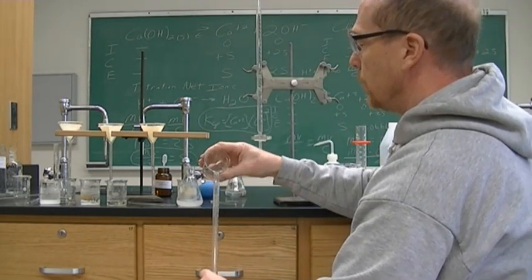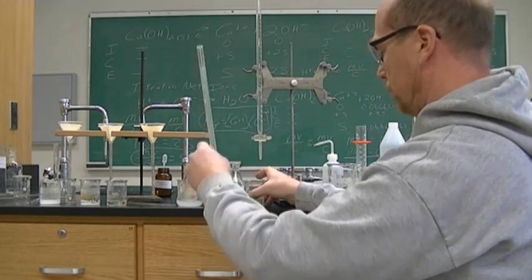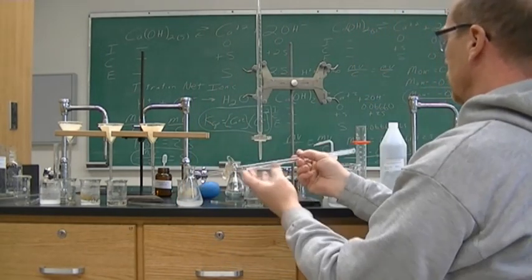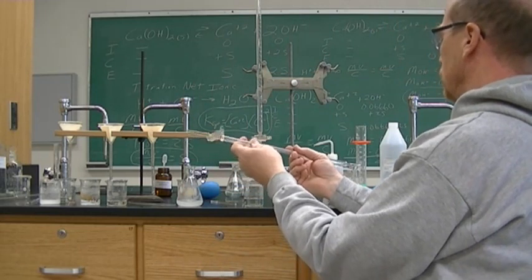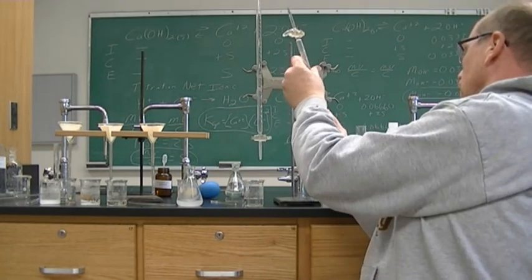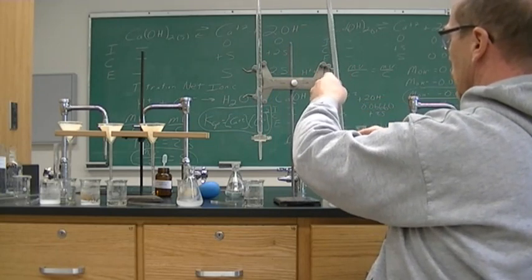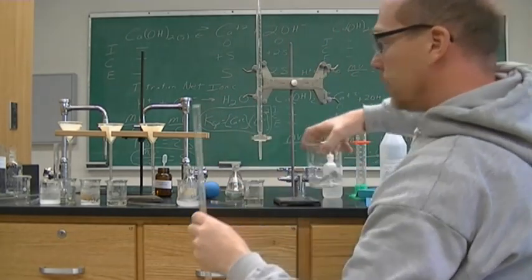And the last one. All right, now we have thrice rinsed our burette, and so we can fill it.